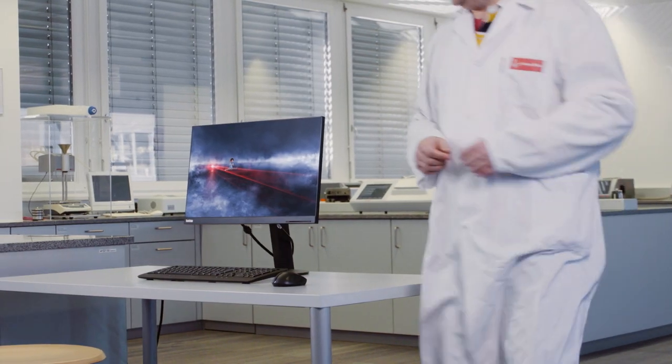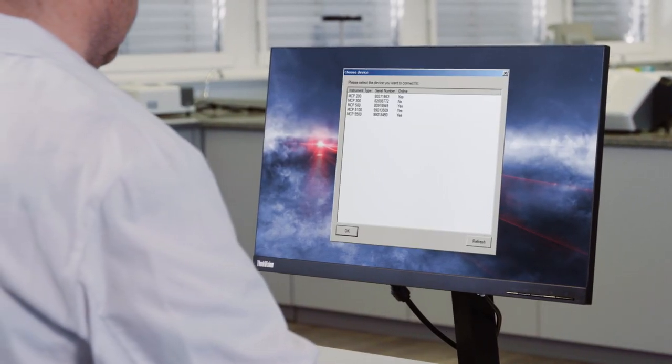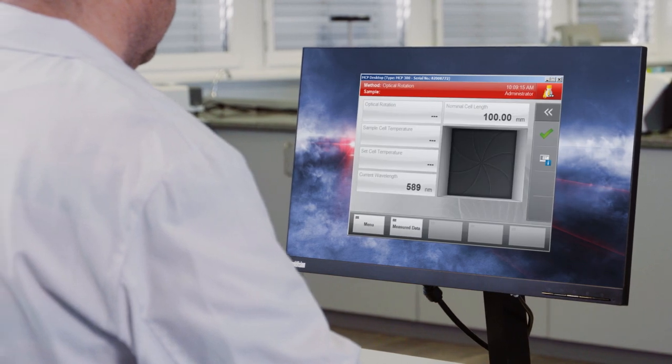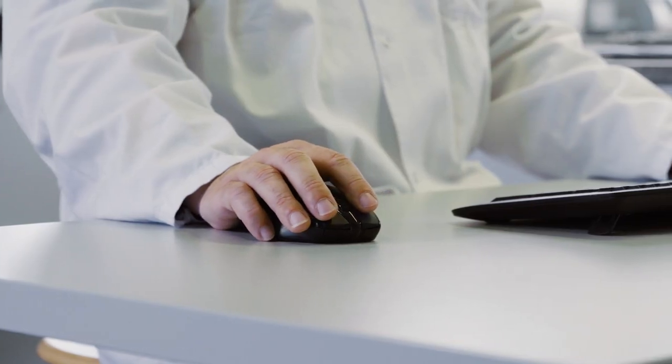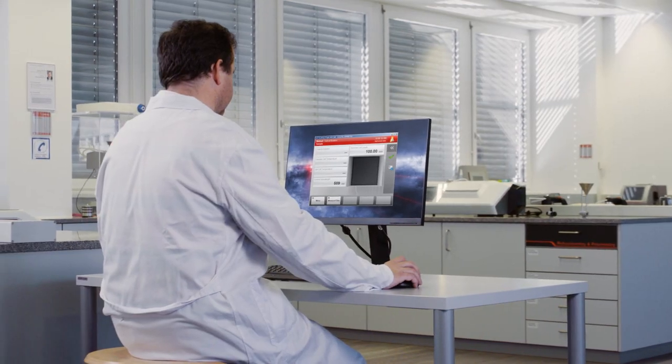The desktop controlled mode allows running the instrument software on a regular PC with full user, system and data administration. The raw data is saved in the proprietary data format directly on the PC database, providing highest data security.